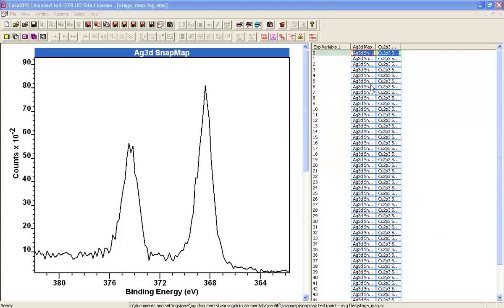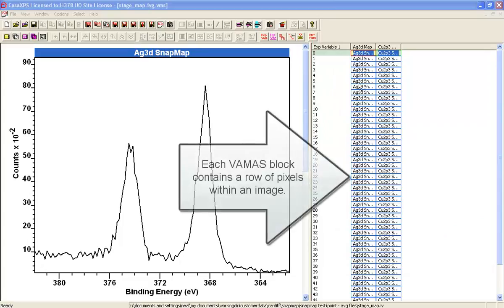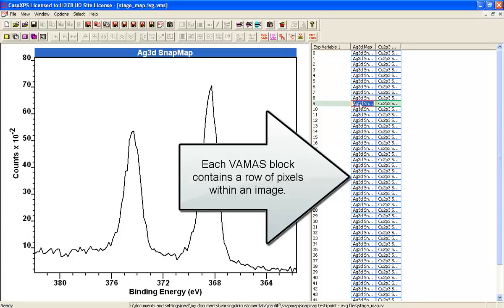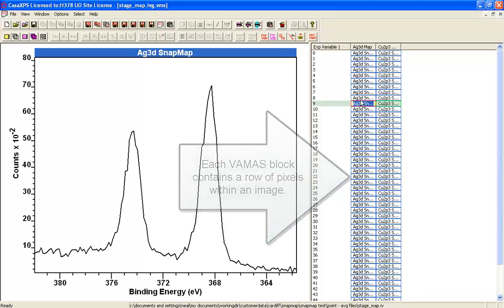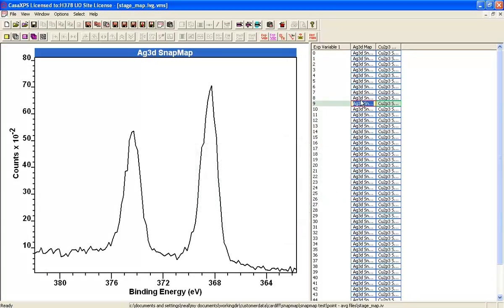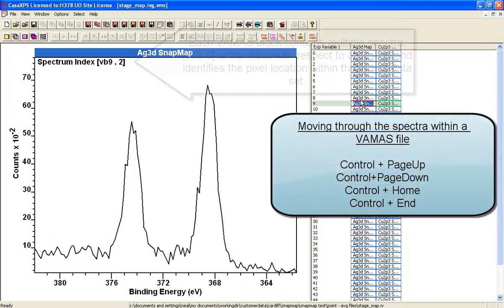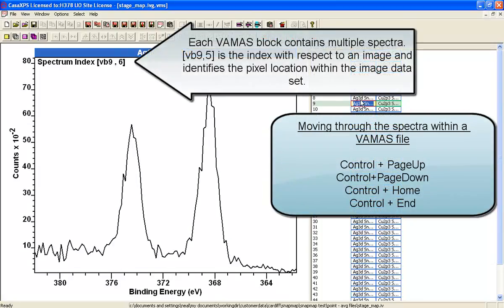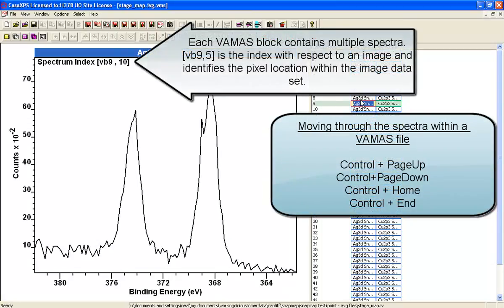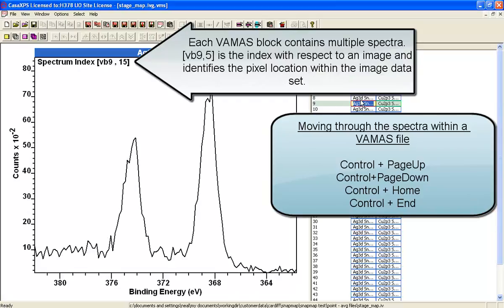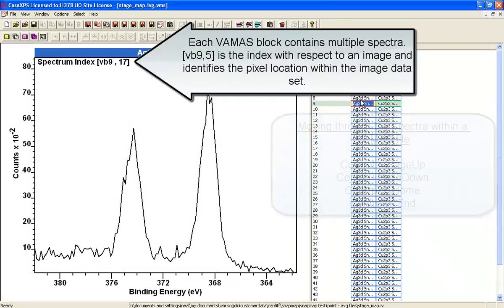The AVG files have been converted so we've got silver 3D and copper 2P spectra in a sequence of VAMAS blocks. Each one of these VAMAS blocks has a set of spectra and these correspond to the positions within the image.